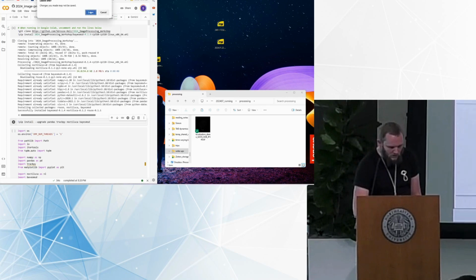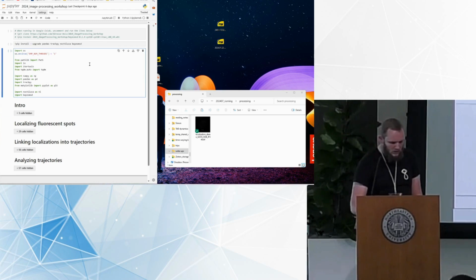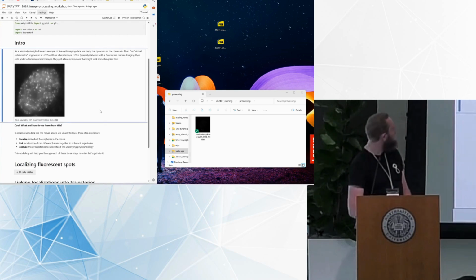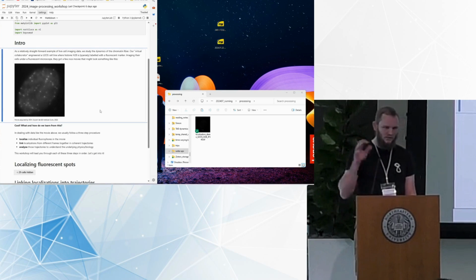As I said, I will run this locally on my machine. Just execute this first code cell to import a bunch of libraries, and then we can start with the intro. So, what are we doing here? This movie that you can see here is a short snippet of the data that we shared with you.